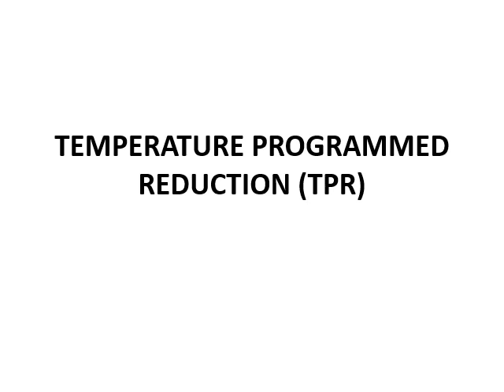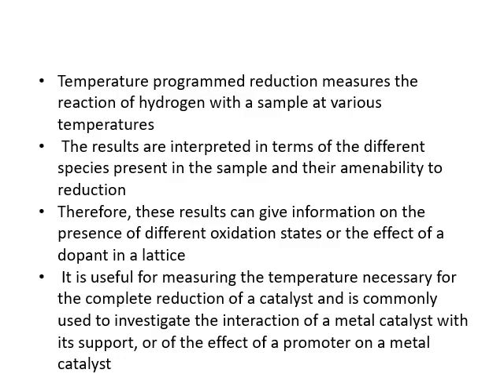Temperature programmed reduction is another characterization technique for inorganic materials. Temperature programmed reduction (TPR) measures the reaction of hydrogen with a sample at various temperatures. As we know, hydrogen is a reducing agent, so hydrogen will react with the sample and will reduce the components which are present in the sample.